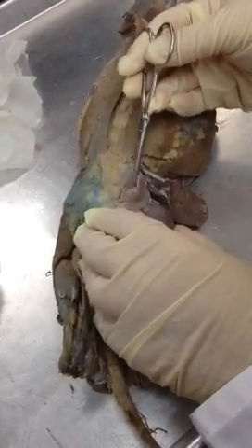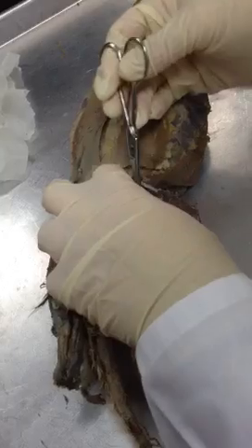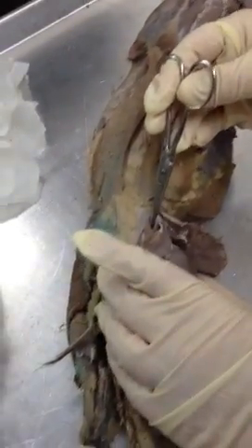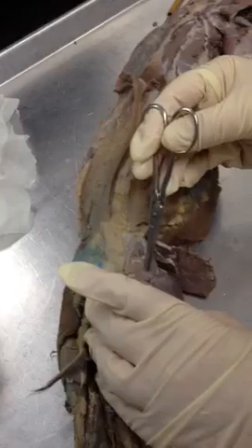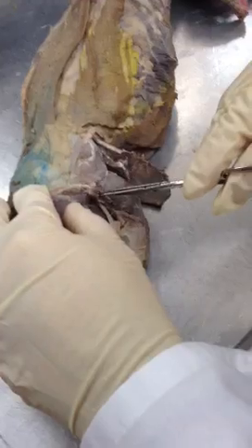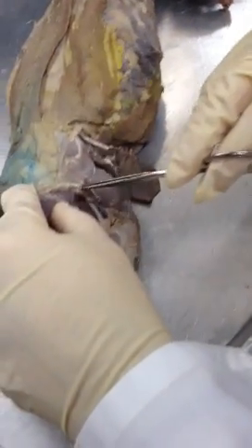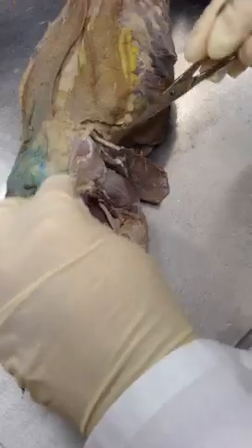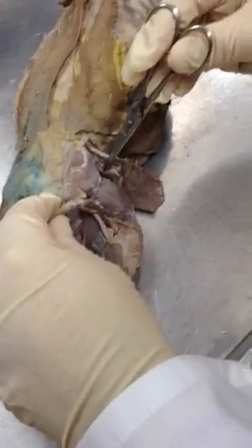Underneath here, on this mink by accident — because my 220 lab doesn't do this — but right there is gluteus medius. So that I did accidentally. Gluteus medius more superficially, gluteus maximus. You also asked about caudofemoralis, or femorococcygeus. See it coming down like this? My mink is a little chewed up here, but that's femorococcygeus, just like that. It's a beautiful mink.